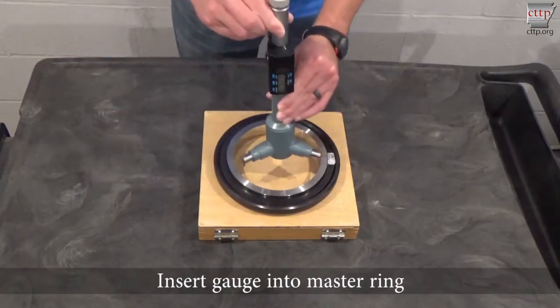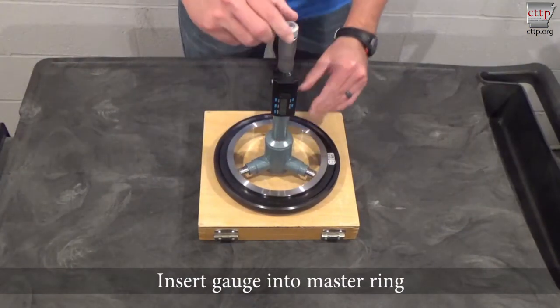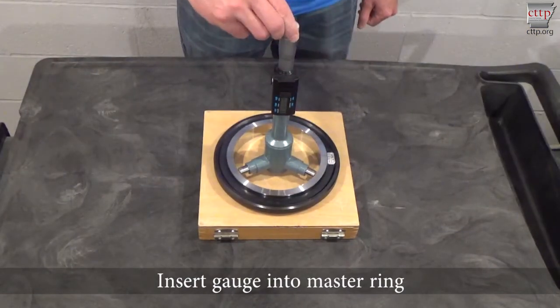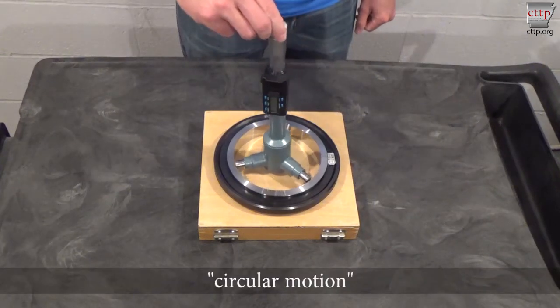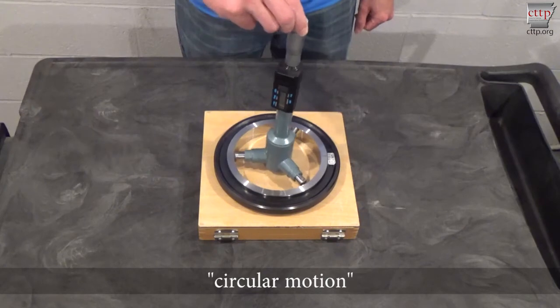Place the master ring on a hard, flat surface and insert the bore gauge into the master ring. To properly tighten a bore gauge, a circular motion is used to help center it in the master ring.